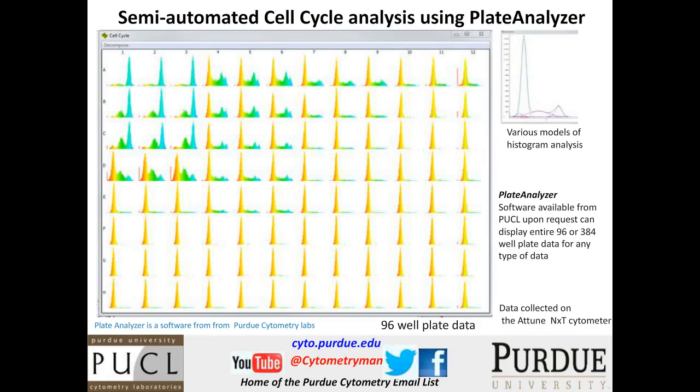G2M. Now, of course, you're just looking at the cells, but what you're doing here is you're saying to yourself, oh, which ones should I look at in more detail? And you can choose the ones that you want to look at in more detail, or you can ignore some of the ones that nothing much happened. So this is one reason.